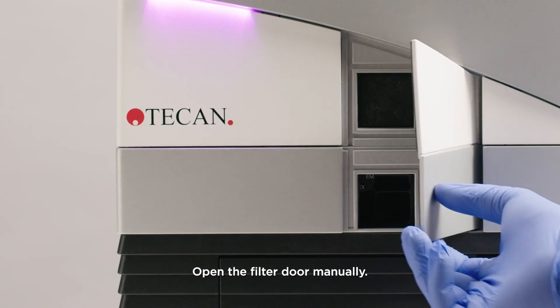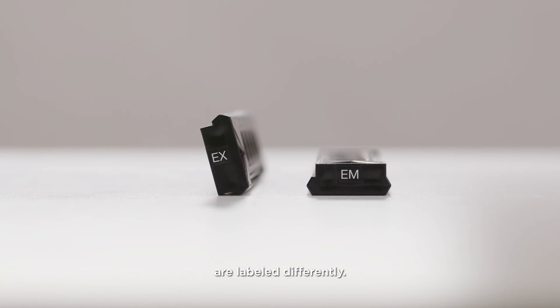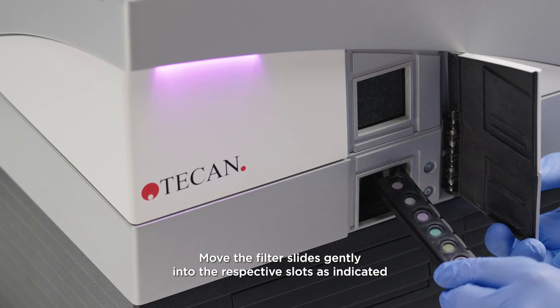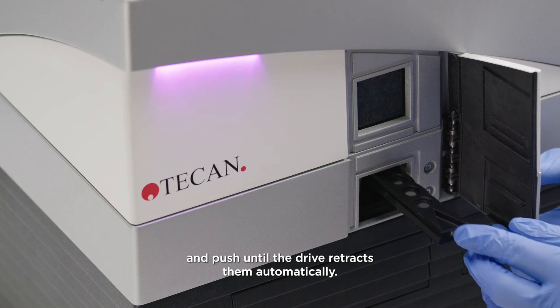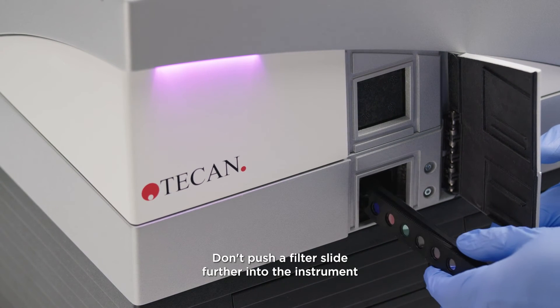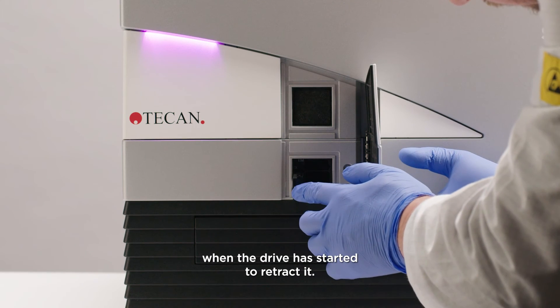Open the filter door manually. For ease of identification, the excitation and emission filter slides are labeled differently. Move the filter slides gently into the respective slots as indicated and push until the drive retracts them automatically. Don't push a filter slide further into the instrument when the drive has started to retract it.